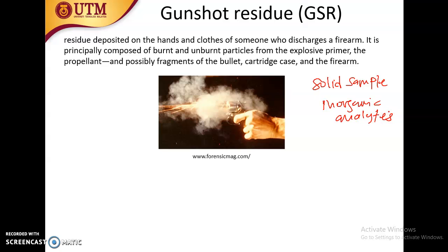Okay, if you are going to analyze with instruments such as spectroscopy, you know immediately you are going to do digestion, right? Either wet digestion or microwave digestion. But what if you want to analyze the components of inorganic analytes using an instrument that can characterize the inorganic analytes while they are in solid?